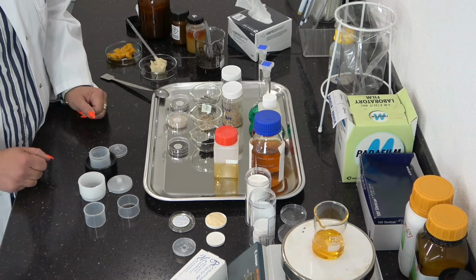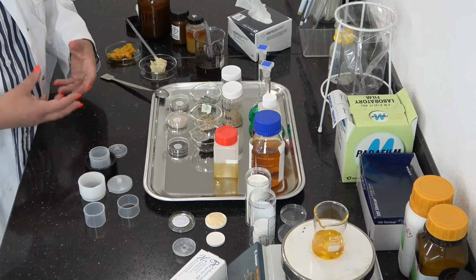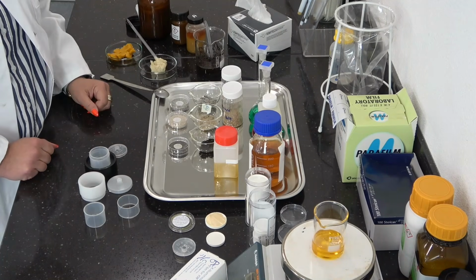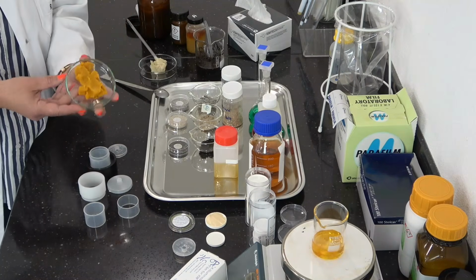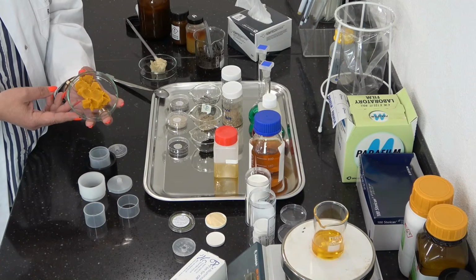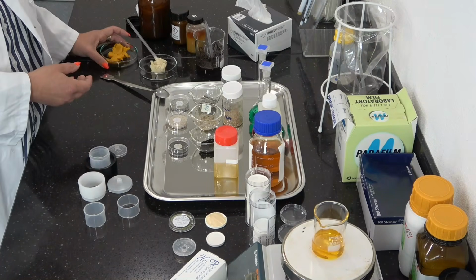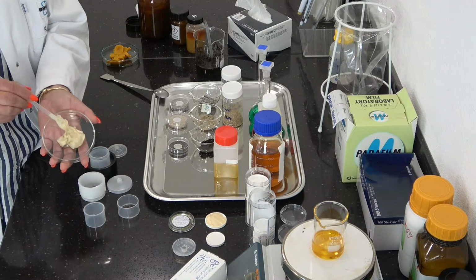We can also have some kind of paste samples, more creamy samples. Sludges can also be very different in composition. Here I have some materials. For example, this is a palm oil sample, which is solid at room temperature, or also some kind of grease sample, which is a little bit smoother.